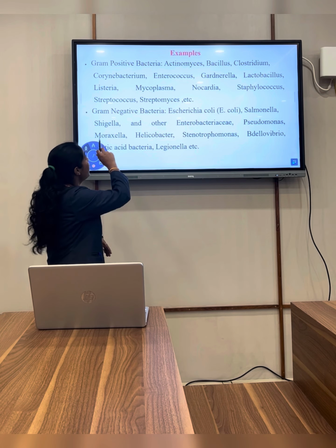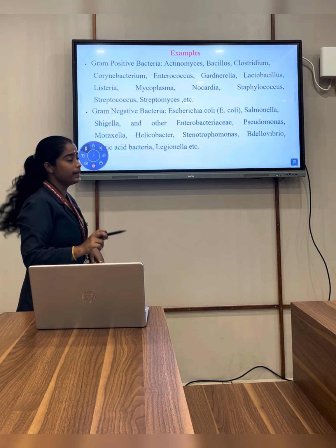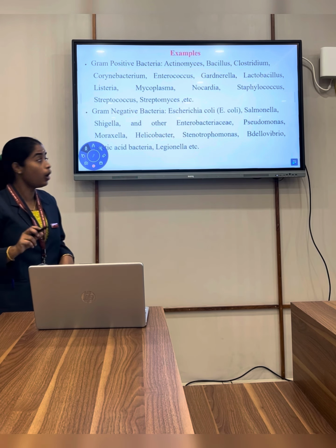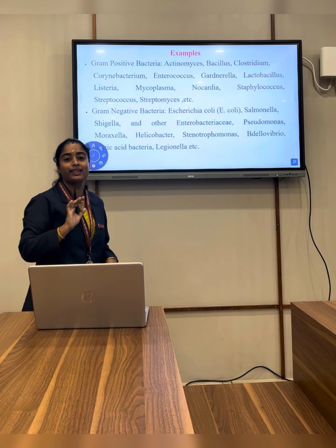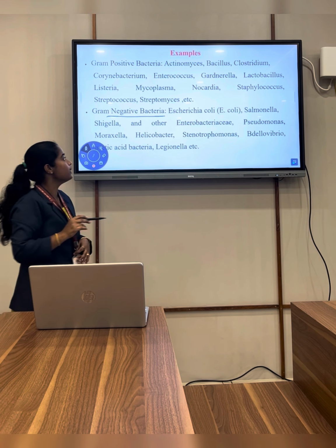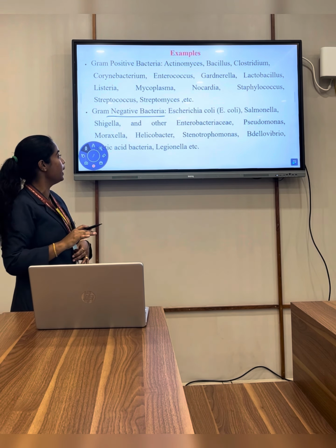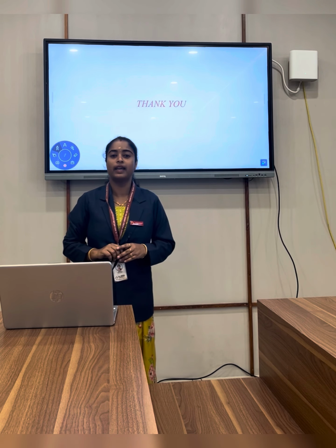Examples of gram-positive bacteria include Actinomyces, Bacillus, Clostridium, Corynebacterium, Enterococcus, Gardnerella, Lactobacillus, Listeria, Mycoplasma, Nocardia, Staphylococcus, Streptococcus, etc. The examples for gram-negative bacteria include the common Escherichia coli, Salmonella, Shigella, and other Enterobacteriaceae, Pseudomonas, Moraxella, etc. These are all about the Gram staining procedure.